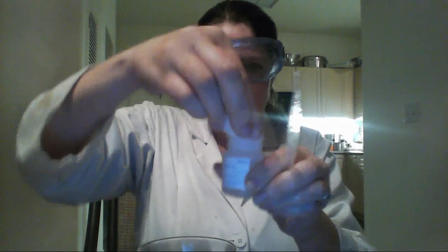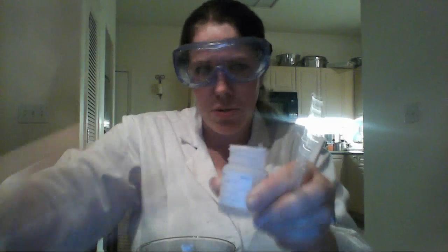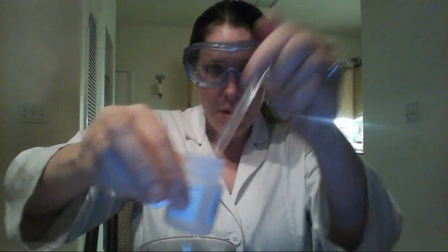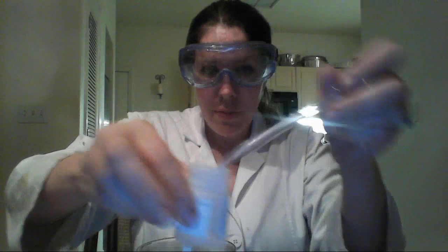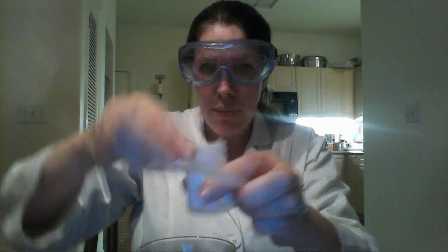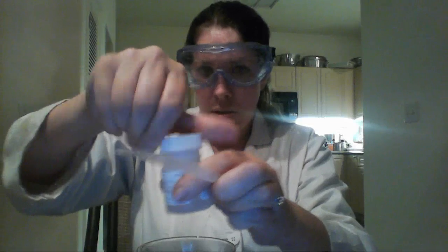And you don't want to have kids or anything around while you're working with this stuff. I'm just going to very quickly fill up my pipette with this. Okay. I'm going to cap this back. Put it to the side.